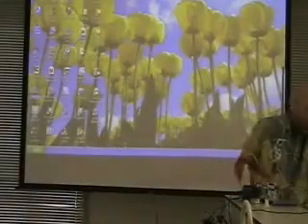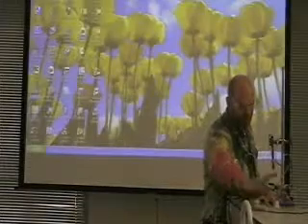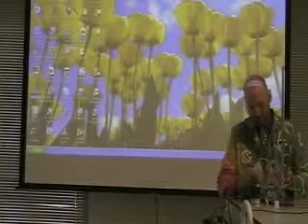I'm breaking my own rule here. My rule is that when you take this little thing off, you need to put it into a very small beaker so that you don't tip it over. I'm breaking my own rule, and watch me accidentally tip it over and blow stuff out.